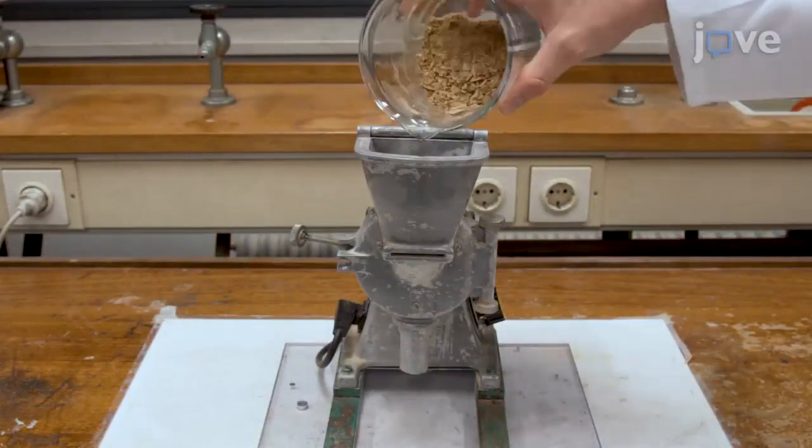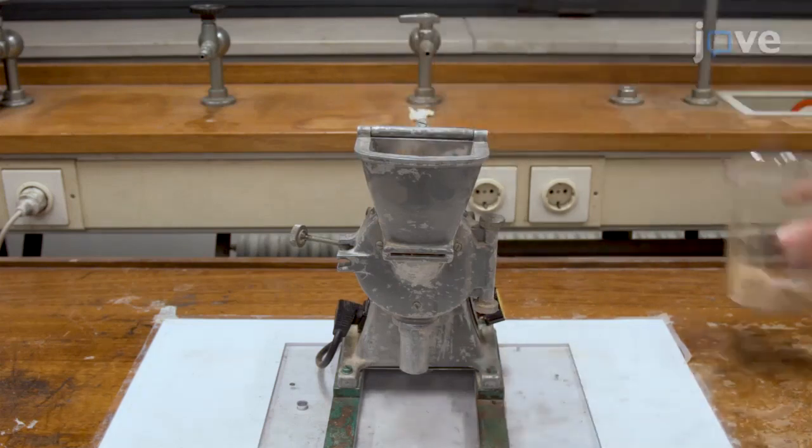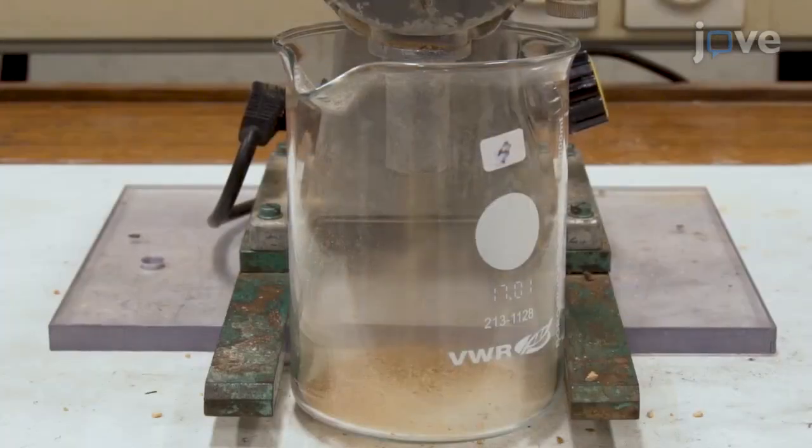To produce the small walnut shell fragments required for milling, feed the fractured shells into a micro hammer cutter equipped with a 2mm sieve at the outlet, collecting the ground shells in a new 1L glass beaker.